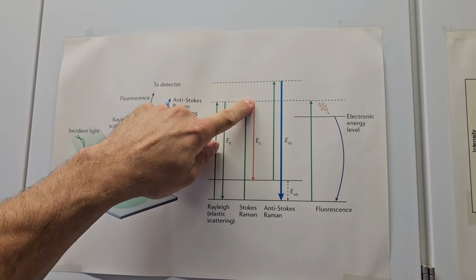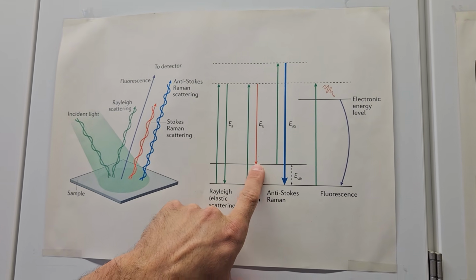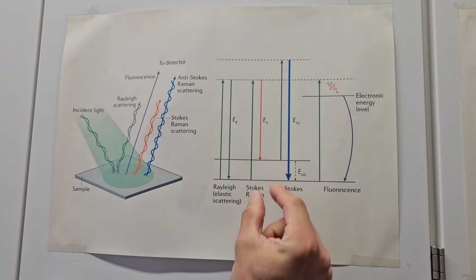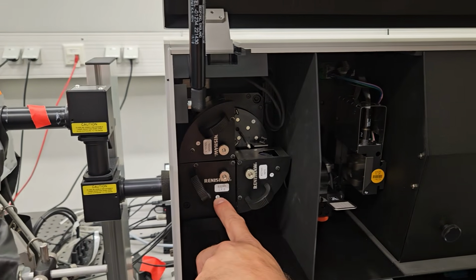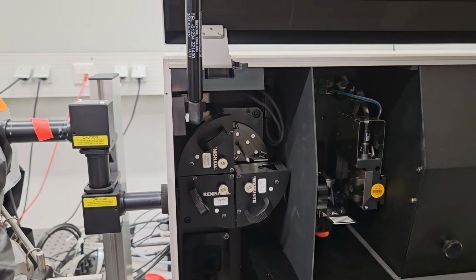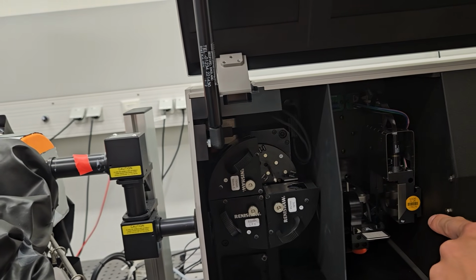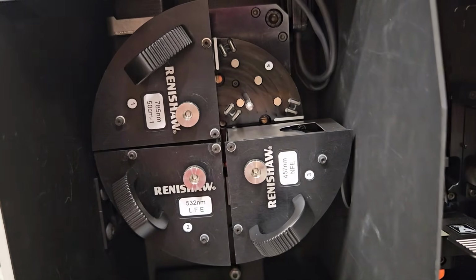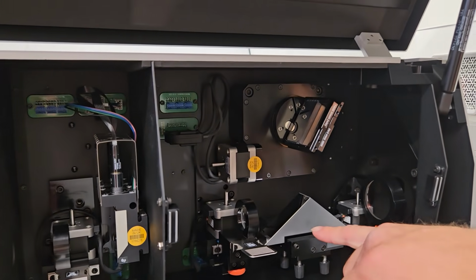A tiny fraction of the light loses some energy via inelastic scattering, i.e. through the excitation of molecular vibrations, and is scattered back with less energy. All the lights come back again. The Rayleigh filter filters out the elastically scattered light from the laser, which has simply remained too much. This means that no more laser light, but only Raman radiation reaches the detector area. There's another mirror there, which directs the Raman light into the grating.